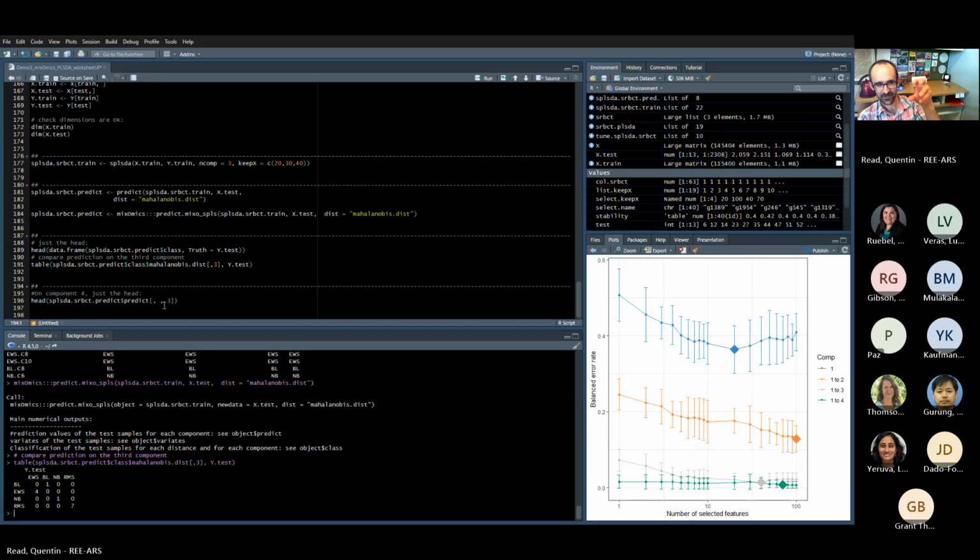Basically Diablo is what we just did with more than one omics together. So it kind of follows naturally from what we just did. Okay, let's go ahead and do that. Thank you, Jesse and Megan, for your input.